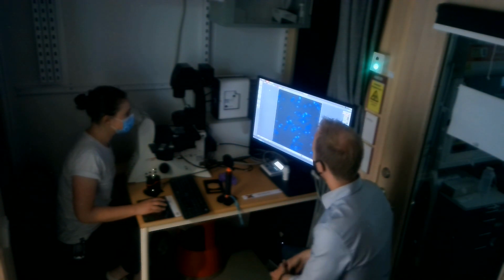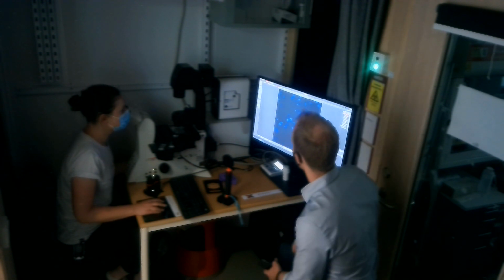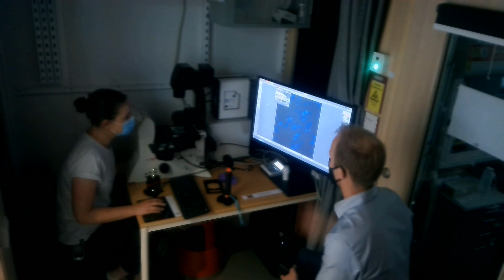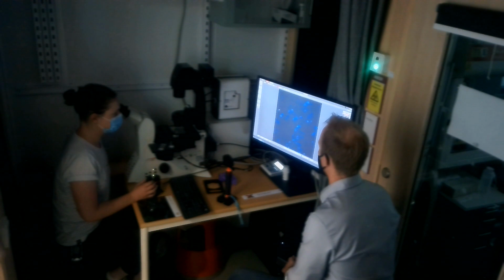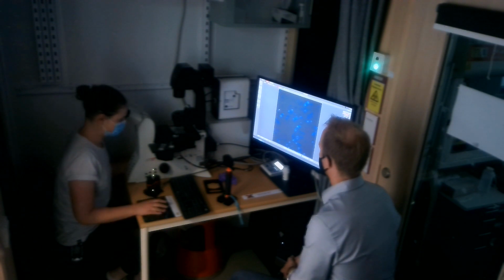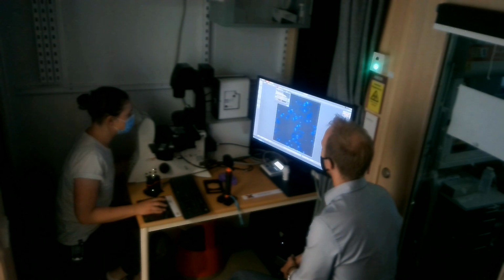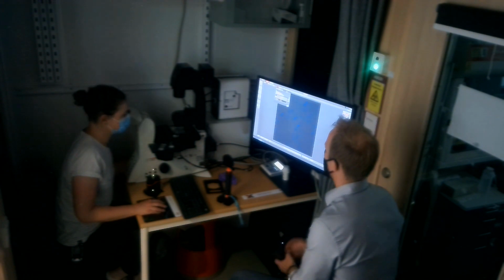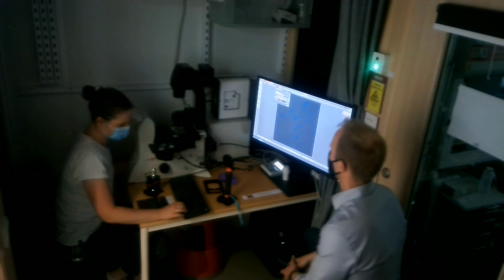So it seems that you have. So now to know if you're overexposed or not, you can just look at the. Click on there, so you can see that you're not cutting the end of it, but they are still very bright. Yeah. So you could, if you wanted to, decrease either intensity or exposure time. So with that one, you can either drag it or you can also write. Just clicking there, you can also type in the exposure time you want.